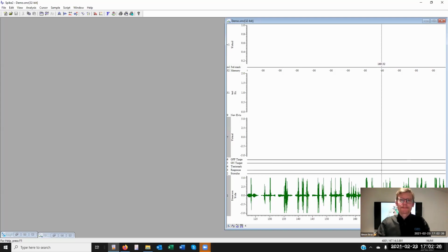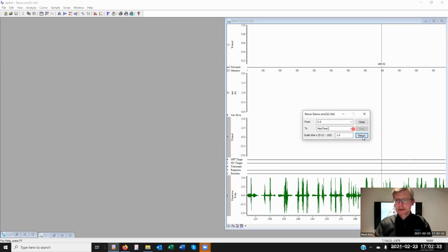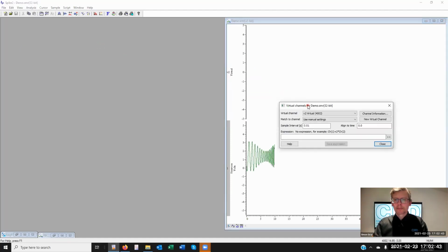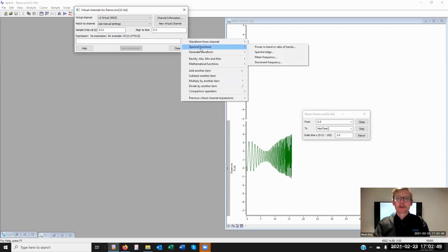Don't forget that we have also, while rerunning or sampling, take this channel, analysis, virtual channels, create new, and we can put into the expression field here spectral functions.